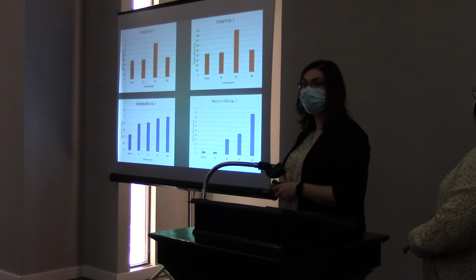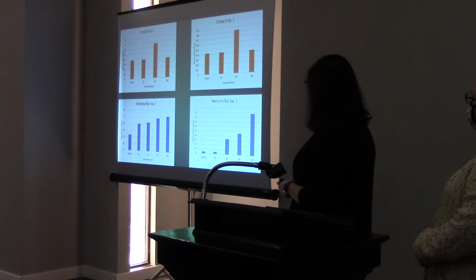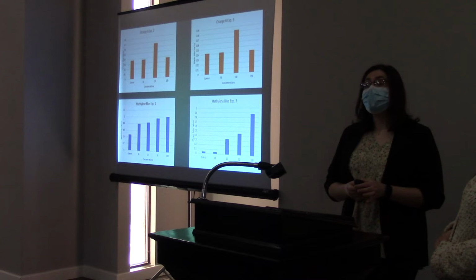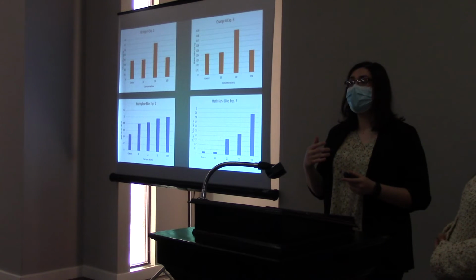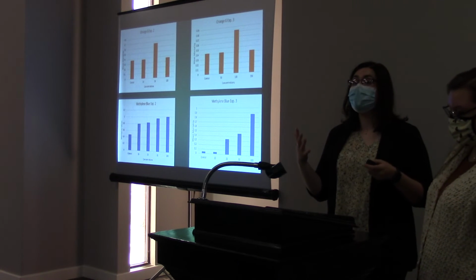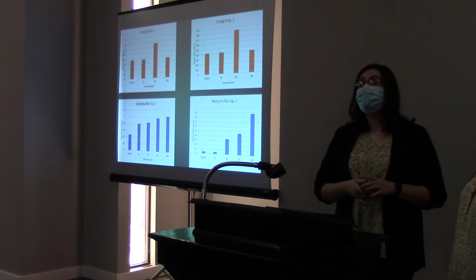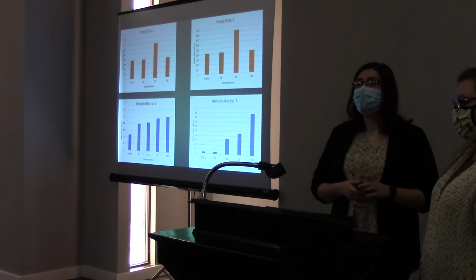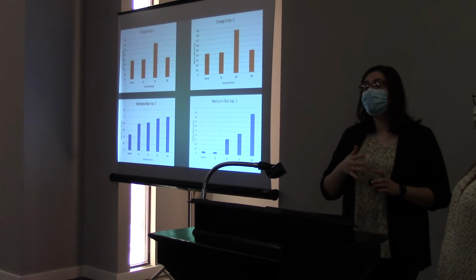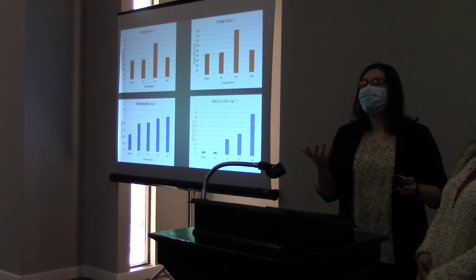Yes. What is the problem with experiment 2? Is there a problem with that experiment? Potentially, we did have some problems with the incubator at the time. We were trying to make sure that it was sealed enough to where our specimen could still breathe, but not get dried out, since that was a huge deal that we had with the first experiment. So it could be that either the eggs themselves were doomed from the start, or it could be that our taping kind of suffocated them.